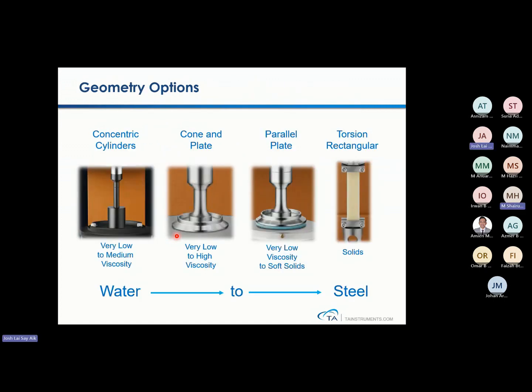Mr. Josh, regarding the liquid sample, what is the specification or dimension for liquid? Maybe there is a certain range that you can share. What do you mean by range? Range of liquid, range of all types of sample. There are typically some limits for rheometers. Is there any limitation for liquid? Liquid doesn't have any limitations. All liquids are capable of being tested, right? Yes, it can be tested.